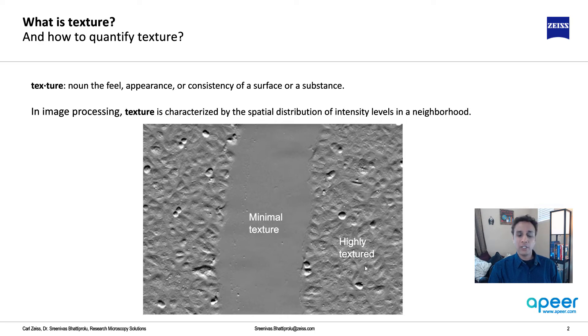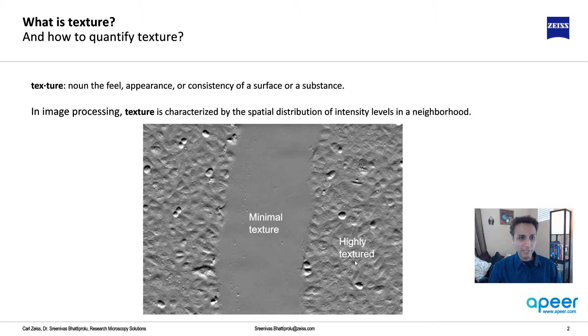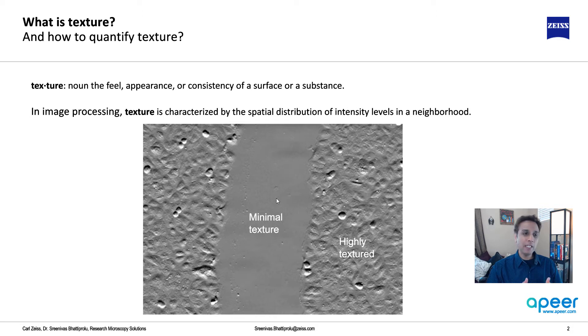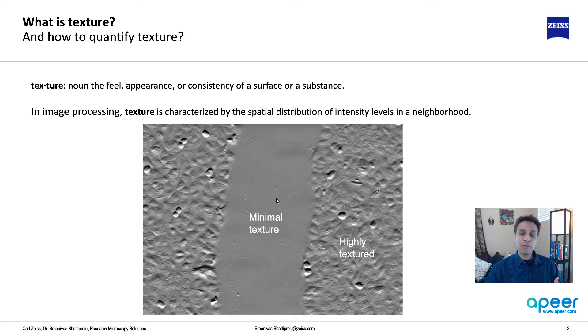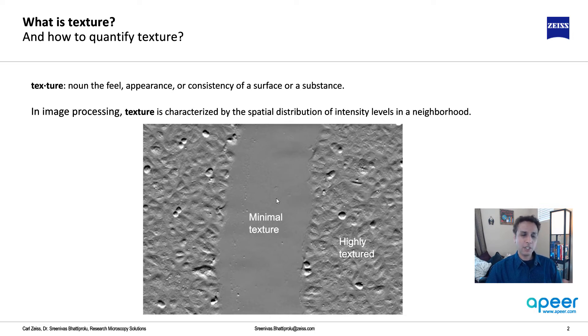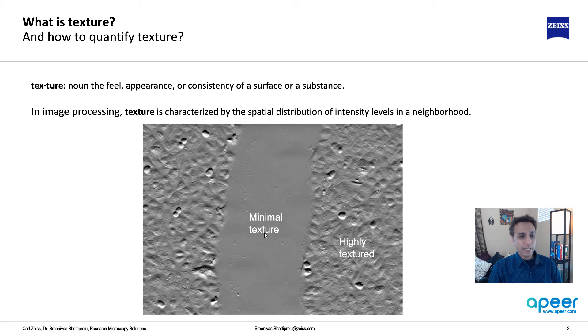This is a wide field light microscope image, which is a single slice of a time series that corresponds to scratch assay analysis or wound healing assay analysis. But let's look at this single image first. So this is what texture is.